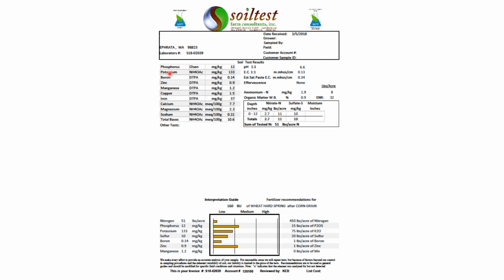Similarly, we list potassium, which is extracted with ammonium acetate. Boron, zinc, manganese, copper, and iron are all extracted with a DTPA sorbitol extractant. This extractant is a chelate, and the sorbitol is a sugar that's able to extract boron. The chelate is used to extract the zinc, manganese, copper, and iron. Lastly are the basic cations, calcium, magnesium, and sodium. Like the potassium, these are extracted with ammonium acetate.